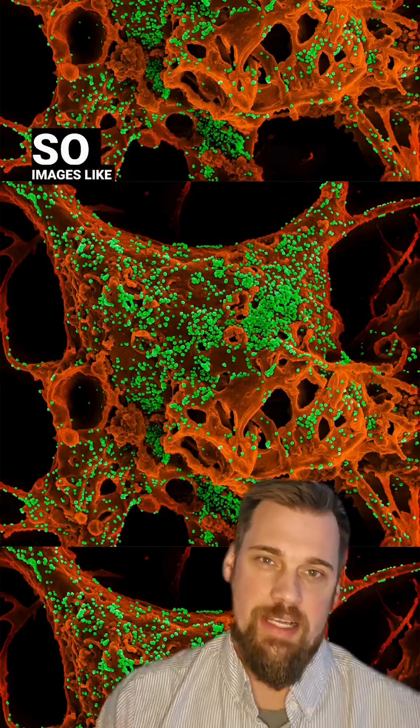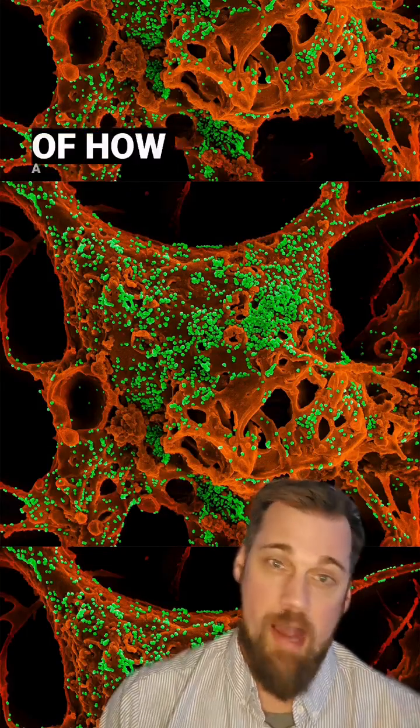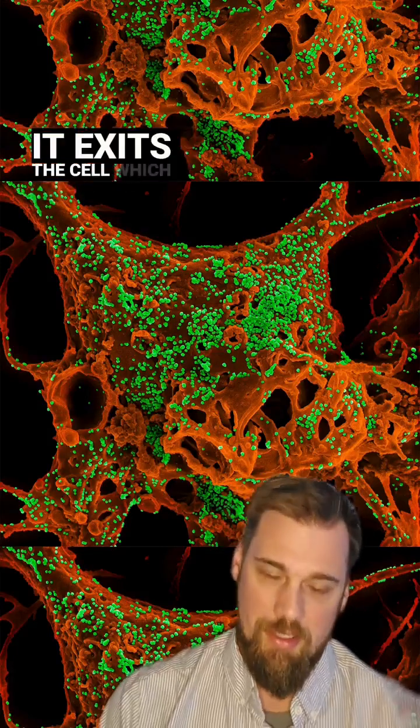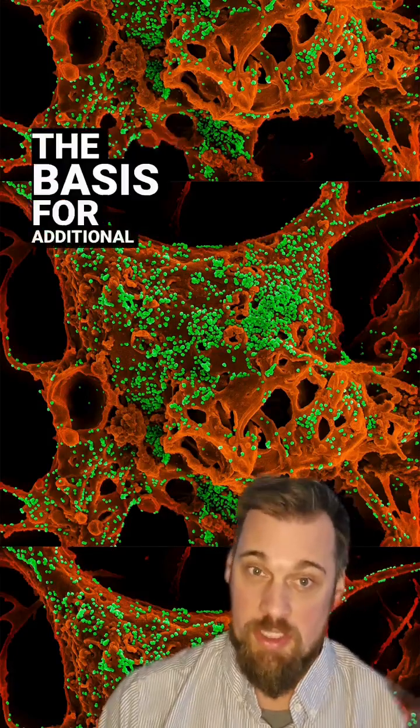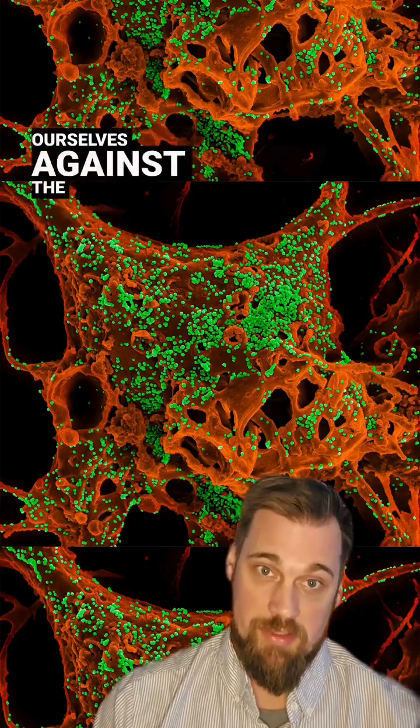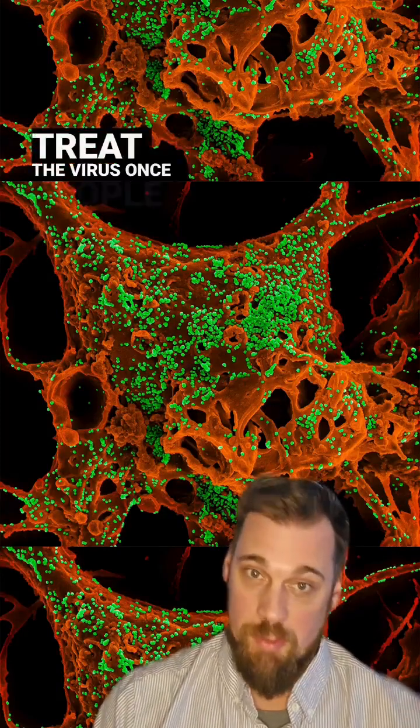Images like these allow researchers to get a better idea of how a virus infects the cell, how it enters the cell and how it exits the cell, which could be the basis for additional research regarding how we can help defend ourselves against the virus or treat the virus once people are infected.